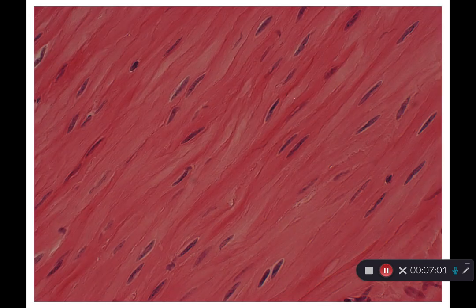And this is what the slide is going to look like. Now there are 2 areas on the slide. One will look like this, and that's what you want to look at. The other one will be cross-section, and all you'll see are all these circles because you've cut the muscle in a different direction. So you do not want that. You want it to look like this. And we have, again, 1 nucleus per cell and no striations.